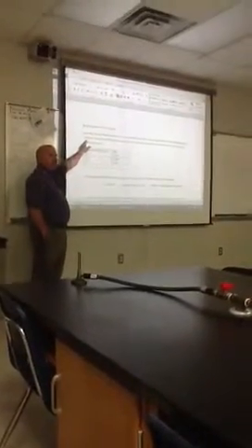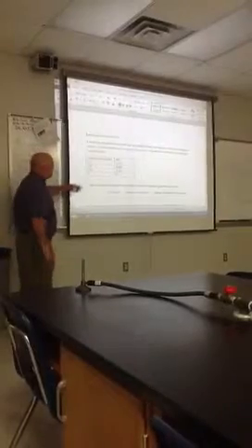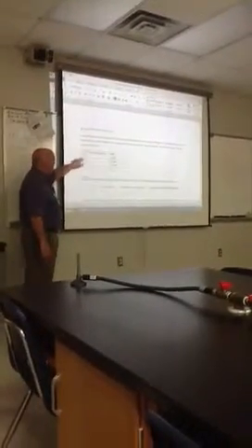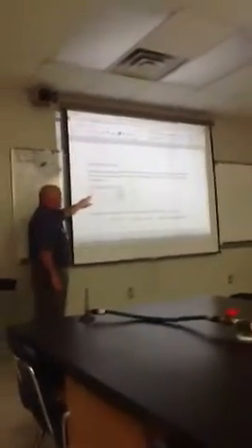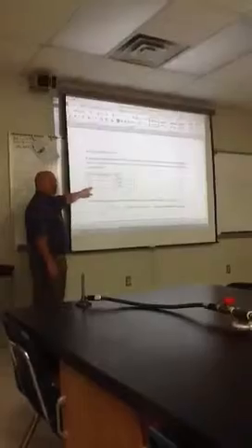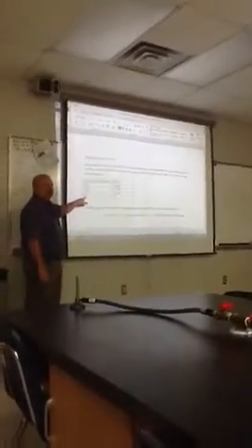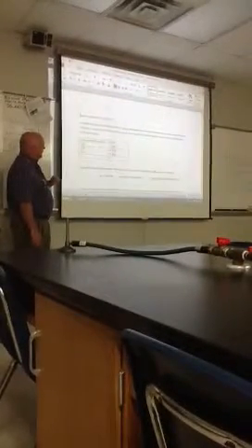543 nanometers. So we set our machine at 543, and then we put these samples in there. We had a sample that had 225 milligrams per liter, a sample that has 110 milligrams per liter, one that has 22.5 milligrams per liter, and then at 0, it still should be 0. So we have basically 4 data points on our line.